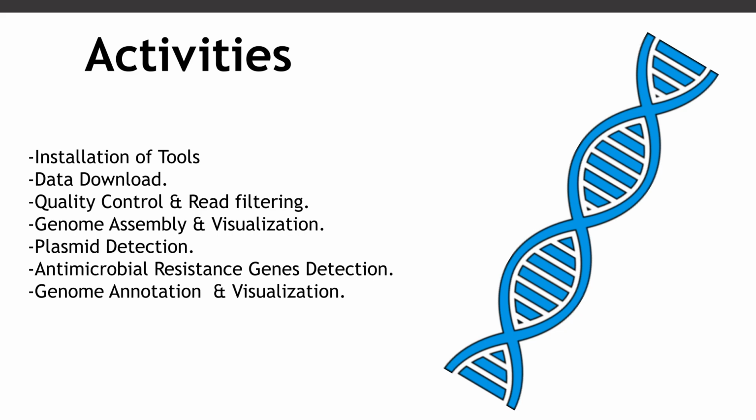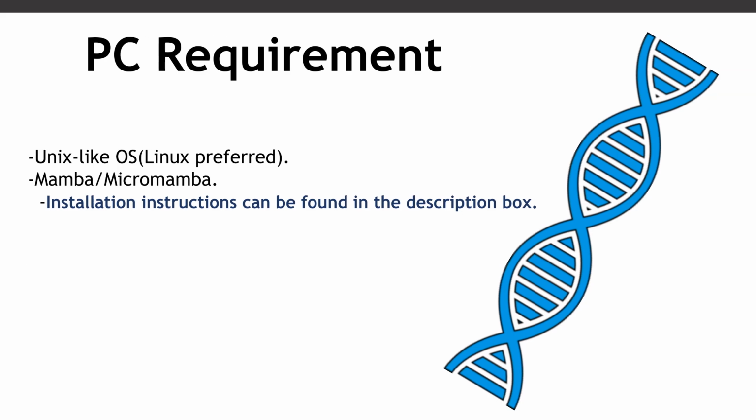So that's it. Now, if you want to follow this tutorial, you need to make sure you have a Unix-like operating system. And so I recommend Linux. That's what I use for my tutorials, by the way. And so I'll encourage you to also use Linux. It's possible to use macOS, but I prefer to use Linux because it's more flexible.